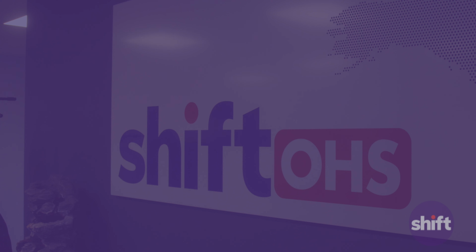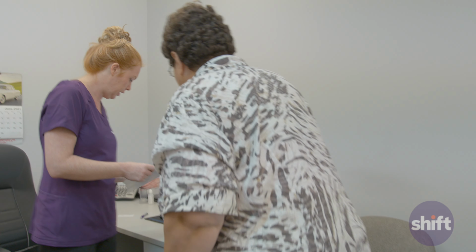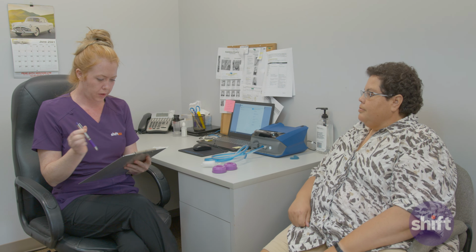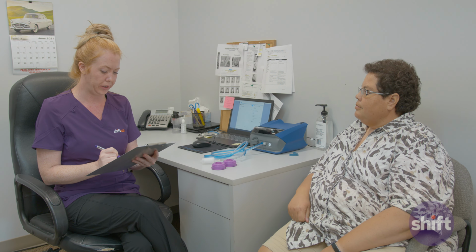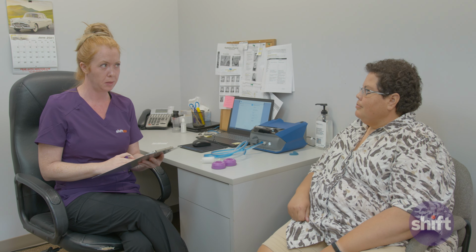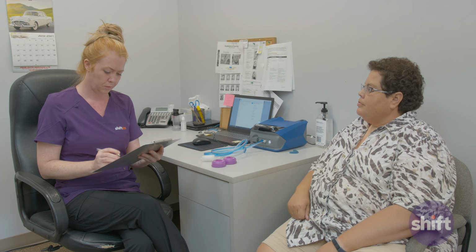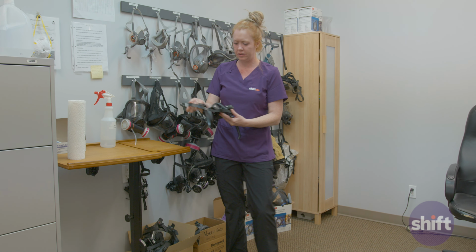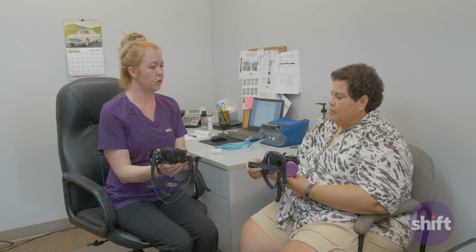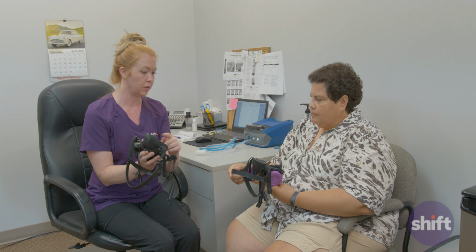or a pacemaker. The technician will review all provided information with the worker, documenting details regarding any noted medical conditions or concerns. If there are concerns about the worker's ability to safely wear a respirator, the worker will be provided with a medical clearance form to be completed by their doctor prior to completion of the fit test. The technician will then instruct the worker on how to properly don the required respirator. To achieve a proper seal for the maximum efficiency of the respirator, workers must be clean shaven.